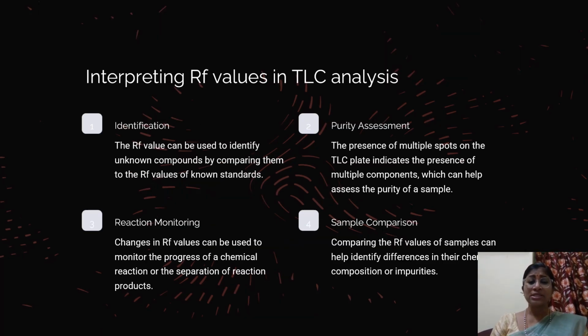So how do we interpret Rf values in TLC analysis? Identification, purity assessment, reaction monitoring, and sample comparison. So identification: the Rf value can be used to identify unknown compounds by comparing them to the Rf values of known standards.